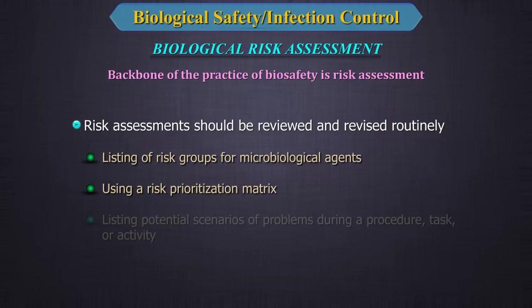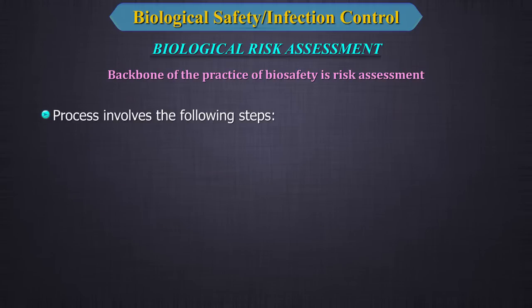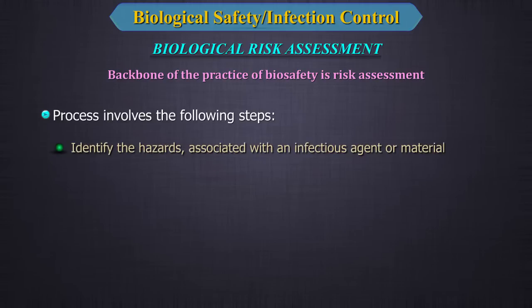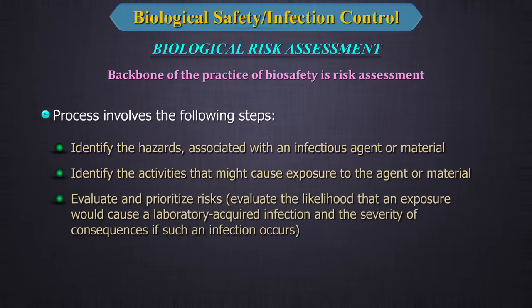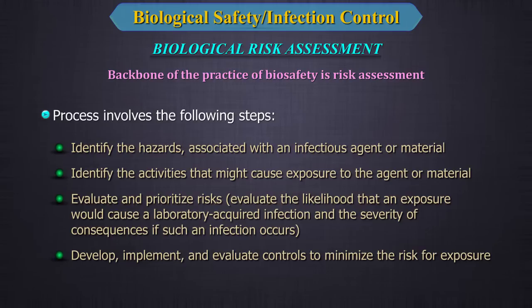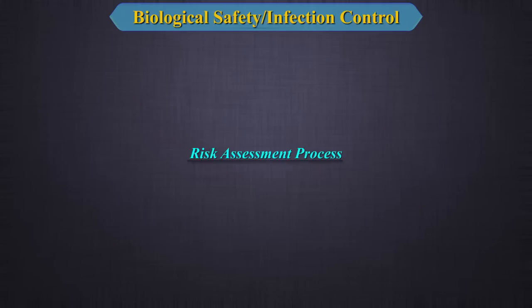Risk assessments should be reviewed and revised routinely, using a risk prioritization matrix and listing of risk groups for microbiological agents. This includes listing potential scenarios of problems during a procedure, task, or activity. The process involves: identifying hazards associated with an infectious agent or material, identifying activities that might cause exposure, and evaluating and prioritizing risks.